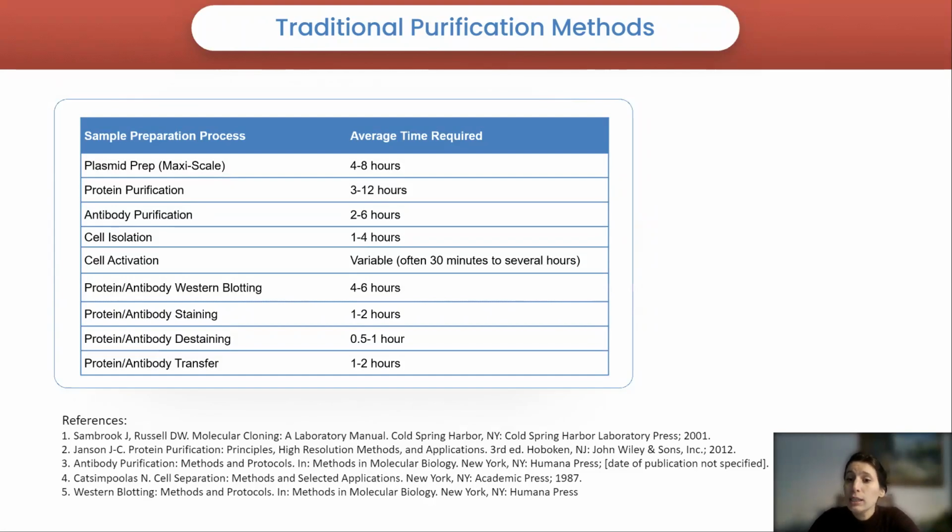There's a couple other examples that I listed out here. I'm not going to go into each one of them for the purpose of time. But overall, the main point here is that basically a lot of these purification or preparation methods are extremely time consuming.